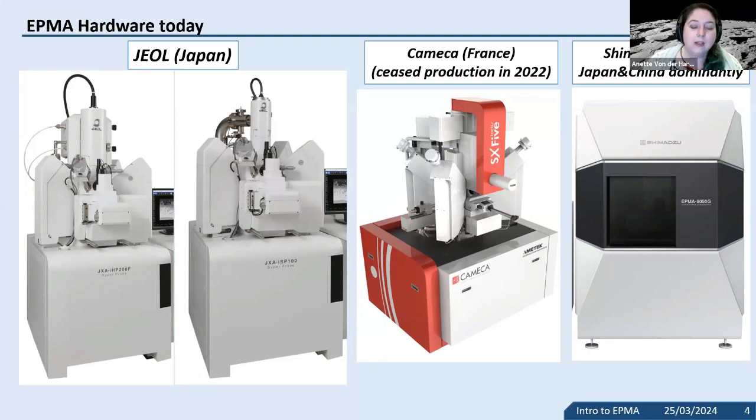So understanding what certain hardware components do, what their inherent precision and accuracy is, can be really helpful in trying to translate analytical recipes to whatever you have access to, but also to assess literature data in terms of quality, together with the analytical conditions that are usually stated.